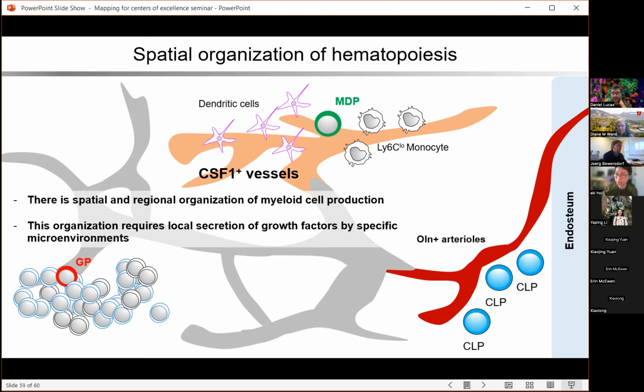If you want to use their machine, you need to generate a section. But you can buy the antibodies and their conjugates from them and do the same type of washes that we did with their system and cleaning. So it should be feasible to do 3D.